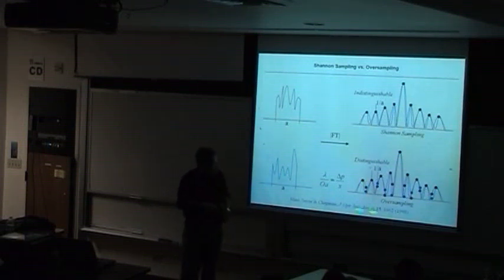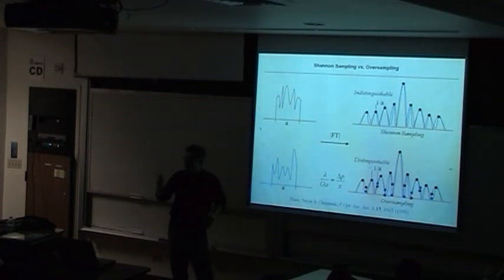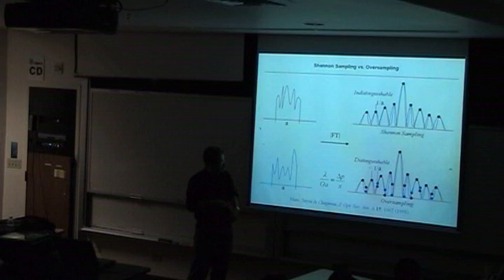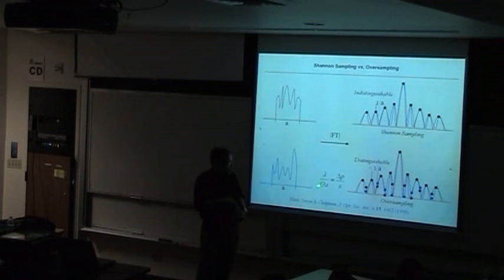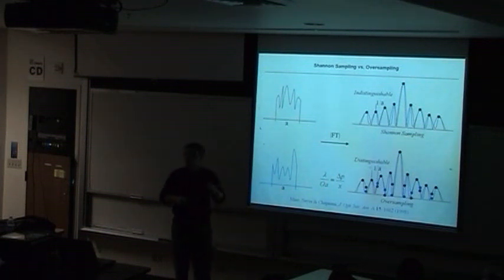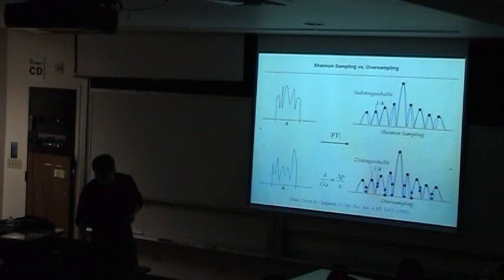In this paper, that's what we explain. We introduce this equation: lambda is the wavelength, A is the sample size, delta P is the pixel size. I think Henry has already initiated this experiment. You're going to try this experiment this week. X is the distance from the sample to the detector, and capital O is the oversampling ratio, the linear oversampling ratio. This has to be larger than 1. We showed that in 2D it has to be larger than the square root of 2 to be unique, which means the number of measured independent points is more than the unknown variables. So that's the basics.